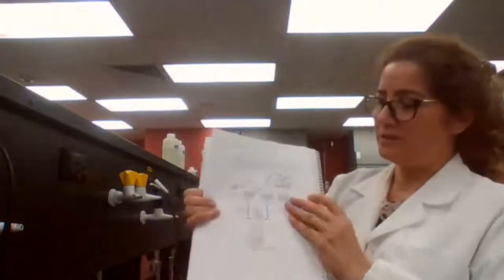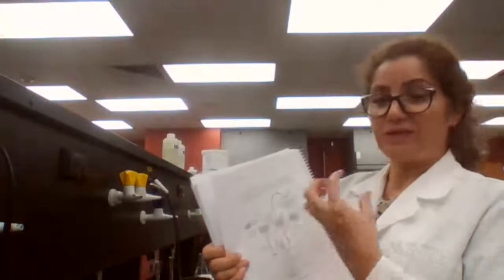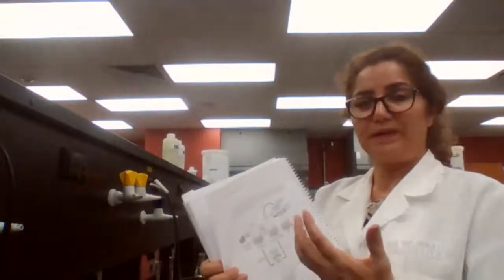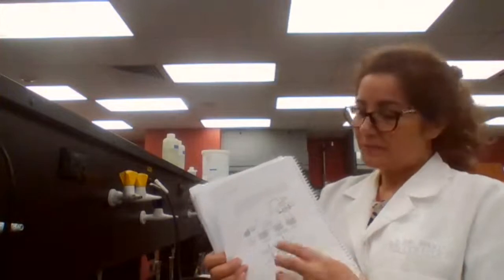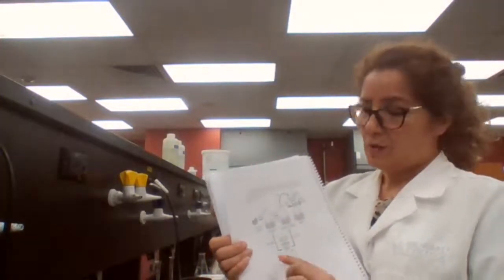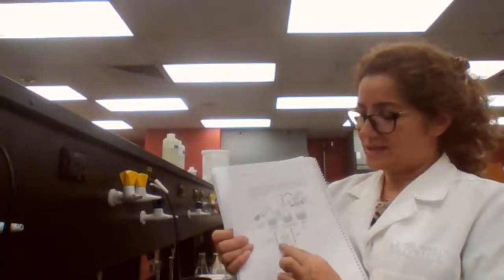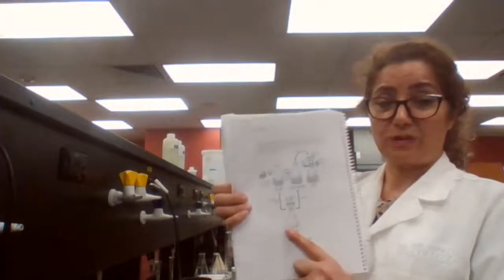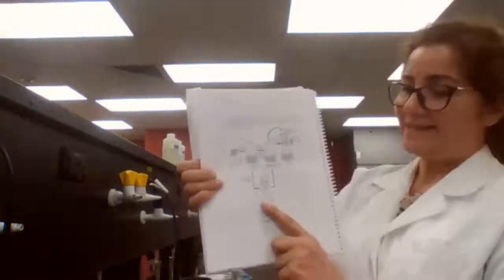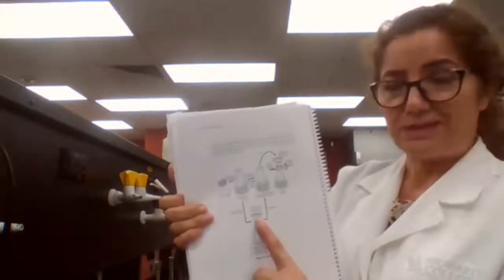And what does insoluble impurity mean? It means that at the boiling point of your solvent, you see that you still have pieces in there that could only be impurities that didn't dissolve. So you do hot filtration. Why should it be hot filtration? Hot filtration means that your setup for filtration is going to be hot, and you filter while your sample is hot. In that case, you do not get premature crystals.